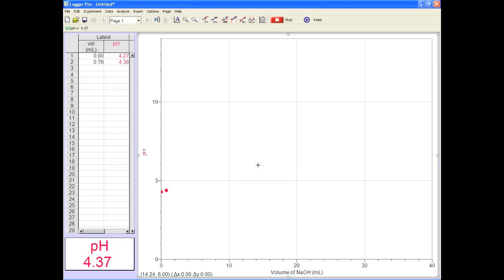Repeat and kick. Now be sure to enter the total amount of titrant for each data point. You'll need to do some complicated addition to figure that out. If you screw this up, you can fix it, so no need to worry. Just pay attention to what you're doing.